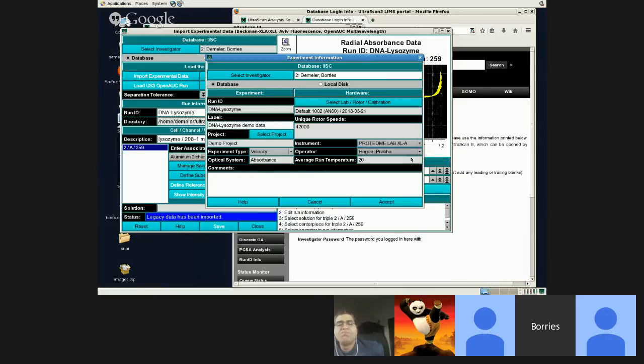And over here you would basically pick whoever is the person that ran the machine. If there are new ones, you have to give them permission to also run the XLA. You do that in that Edit Info tab that we looked at before, Siddhartha. So you can give other people technician privileges for the machine.